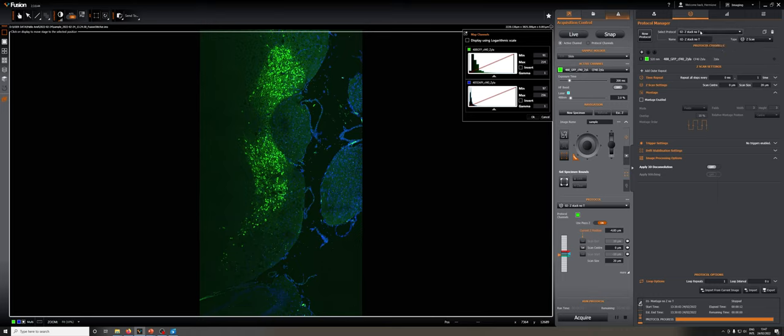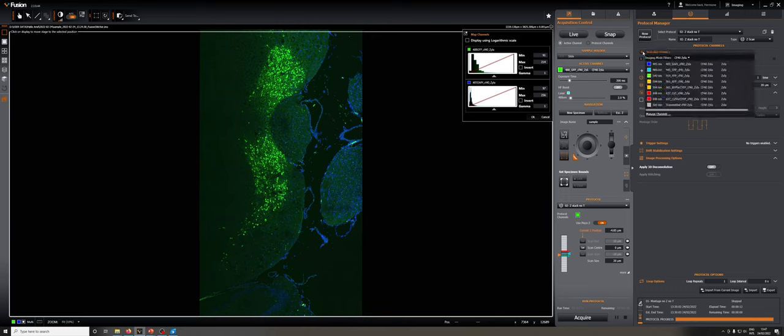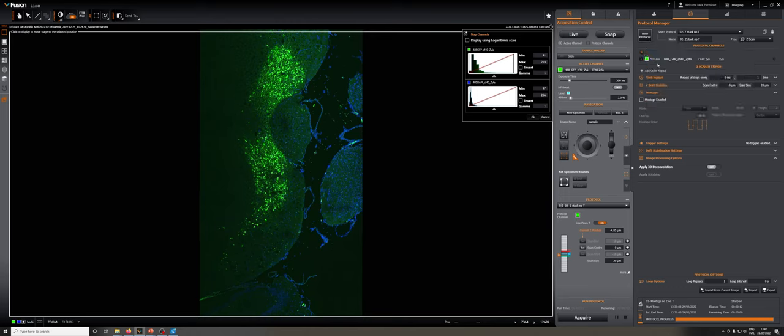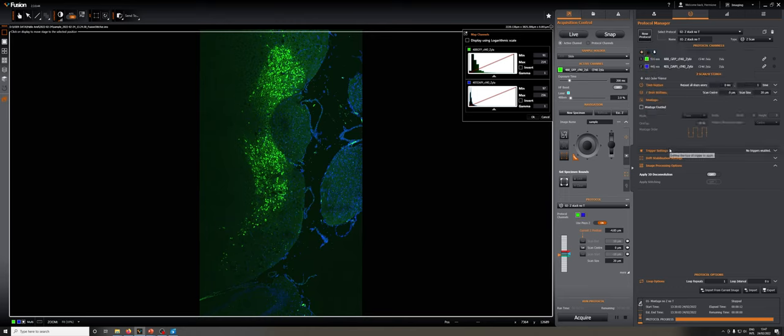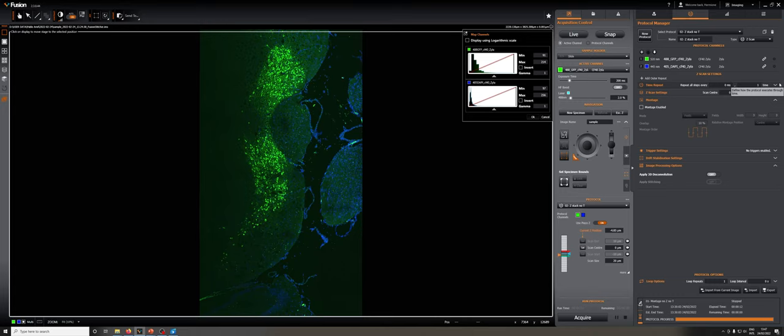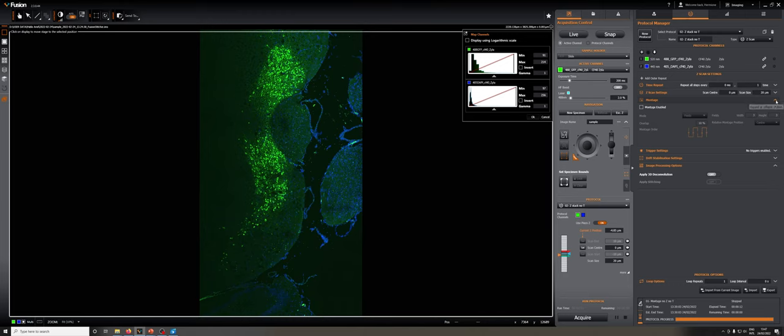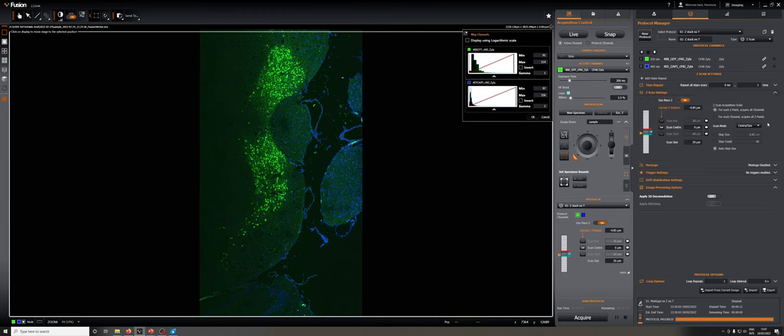Once I change protocols, I have to make sure I have the channels that I want. I'm going to add DAPI. I still don't want to do any time lapse. Now you can see the montage is not enabled. I'm going to minimize this and expand the Z settings.